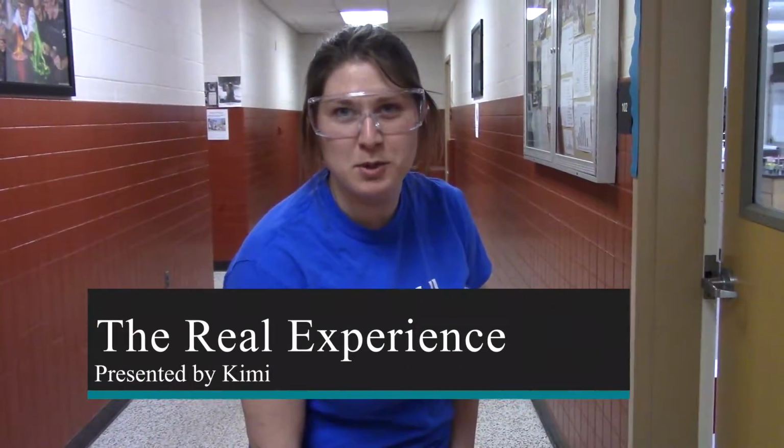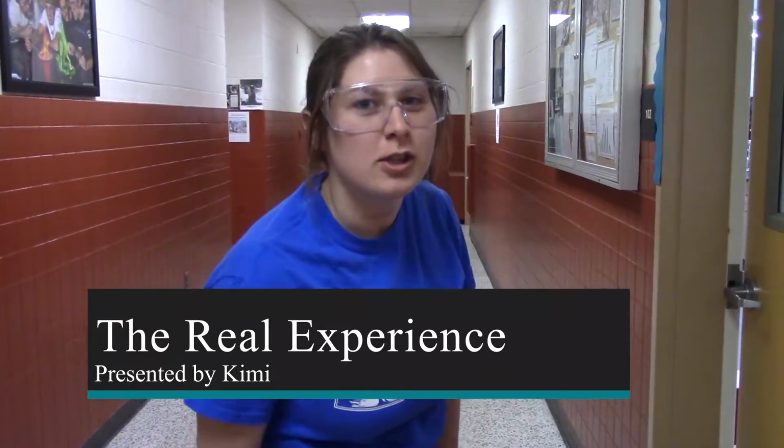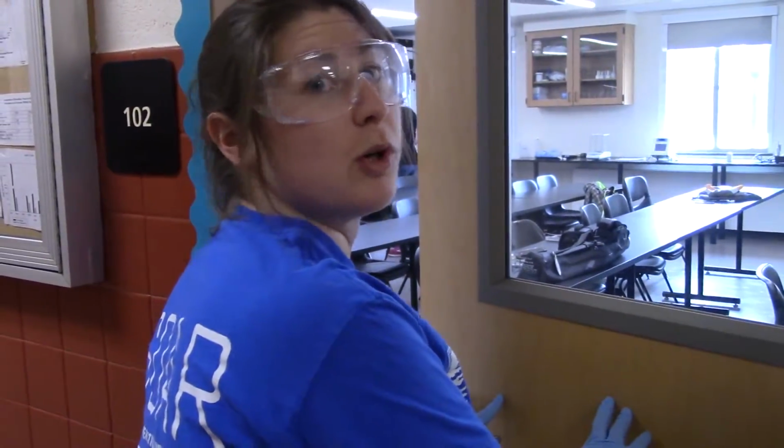Welcome to a wild chemistry class. Make sure you have your protective gear on. Let's go. We have to be quiet so we don't spook them.